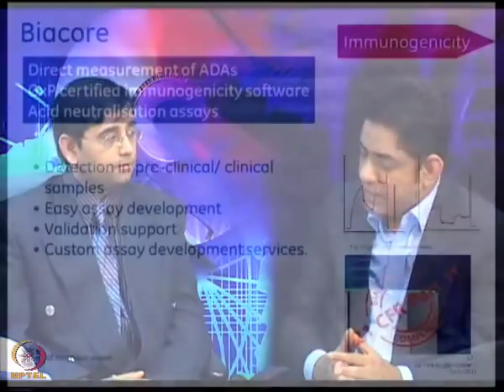I think that's a very strong application of it, because many times you'd like to know how accurately you can determine the protein concentration. Absolutely, especially in quality control and in filling in biopharmaceuticals, where people need to exactly estimate how much they are actually filling in the final vial that goes to the patient. They need more accurate methods of measuring active protein concentration. And that is where I think Biacore will play a very big role in letting people estimate that active protein concentration.